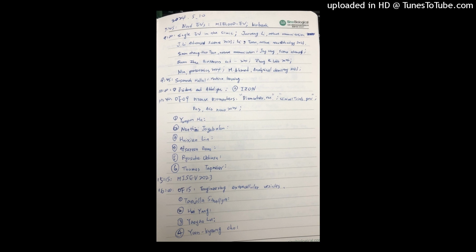That has been, I think, three or four years of work in total, but the answer is yes, we can measure the same concentration of vesicles in a given sample, keeping in mind that the vesicles are very heterogeneous. Vesicles are the only element present in blood that are very heterogeneous in size and do not have a unique surface marker. So that really makes comparability even more complex. But it is possible to measure the same concentration of a particular type of vesicles, let's say platelet-derived vesicles.